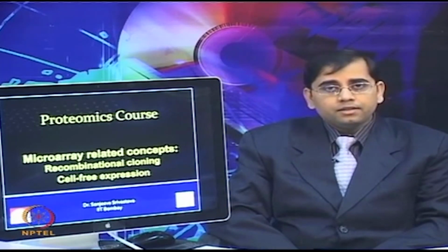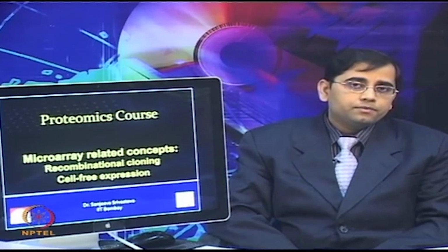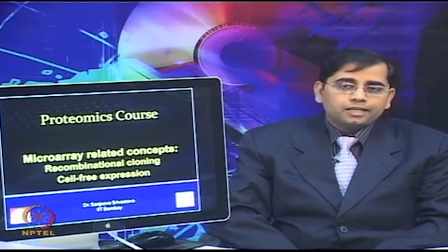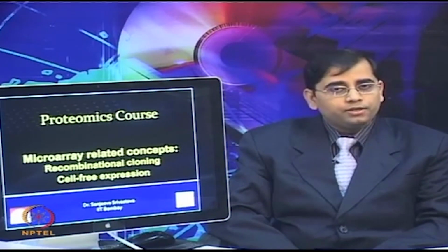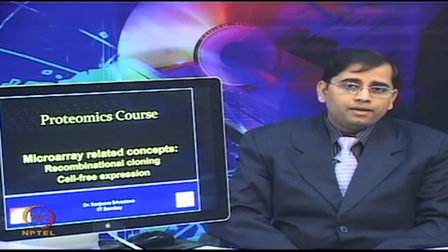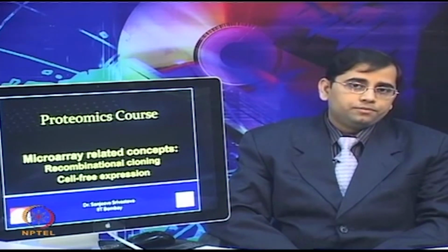In this light, functional proteomics is an exciting new approach to study protein function in a high throughput manner, and it will enable the expression of proteins and subsequent assay of various properties such as subcellular location, interacting protein partners, and biochemical activity. These are regulated at the scale to achieve the high throughput.